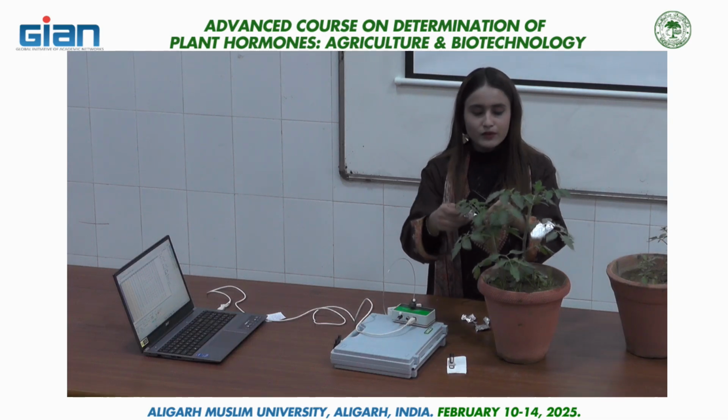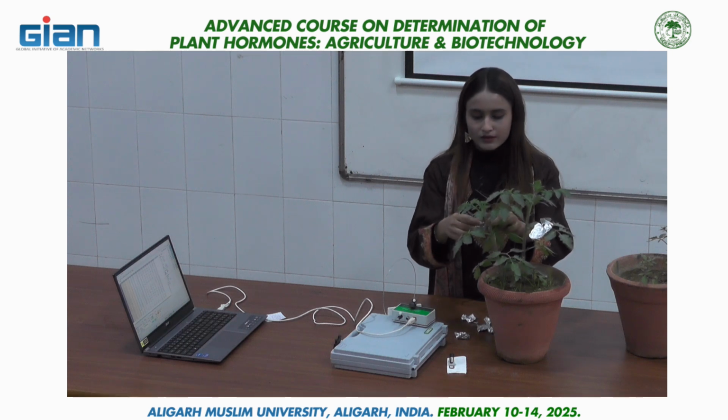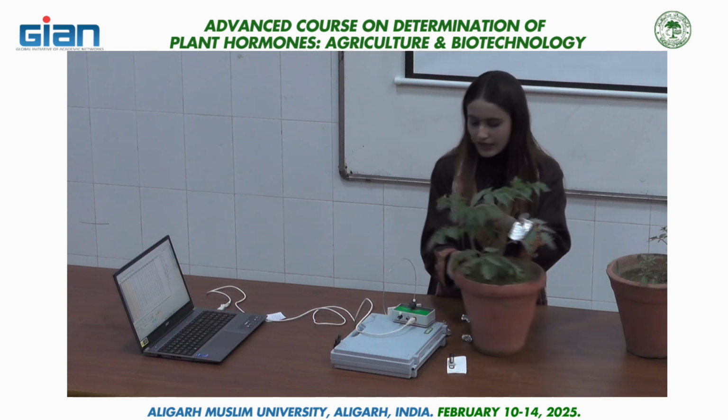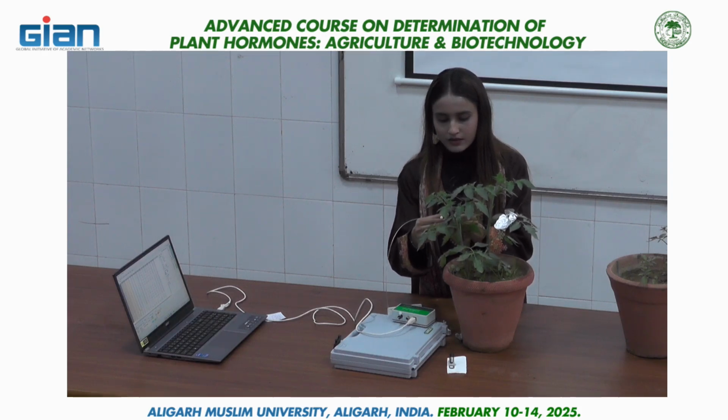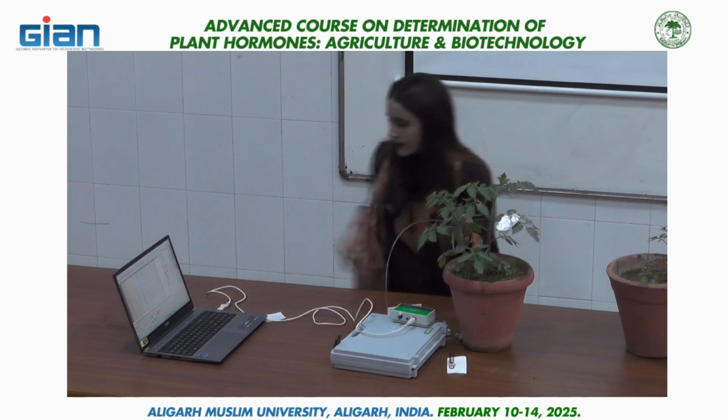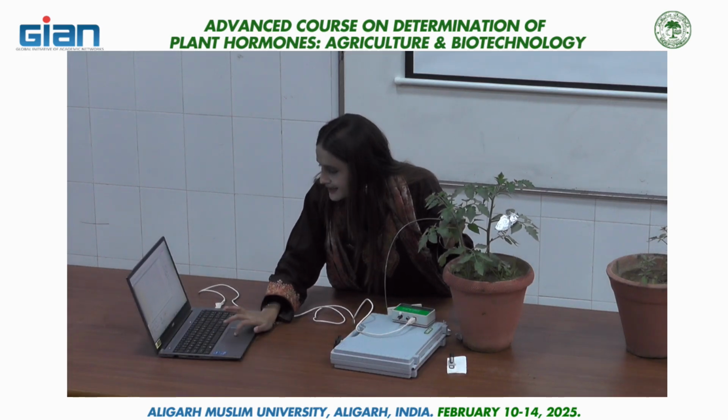Again we remove this foil from our leaf, and then click on set.